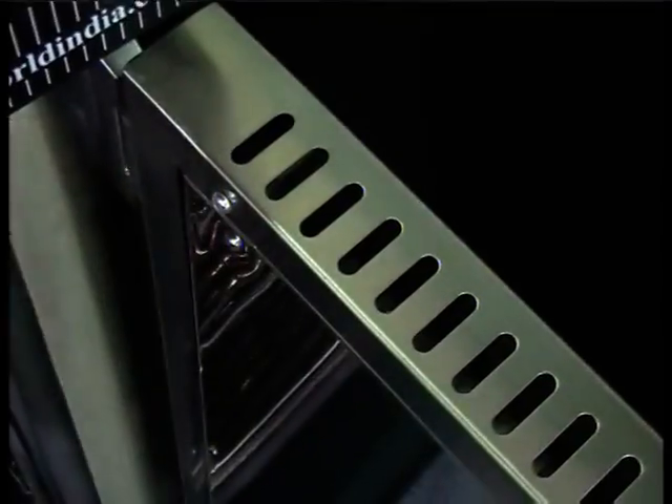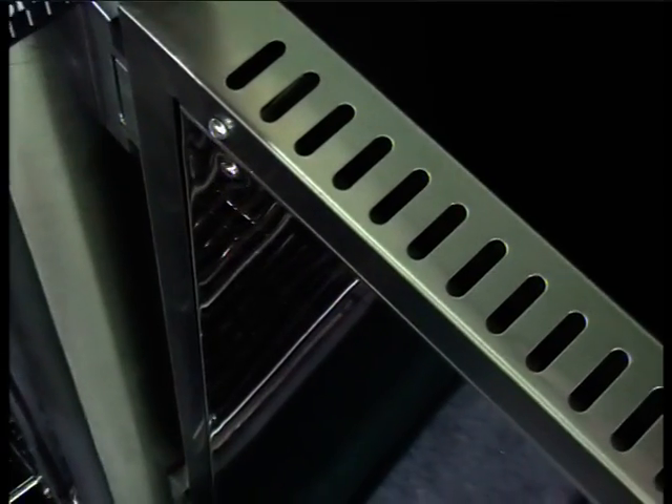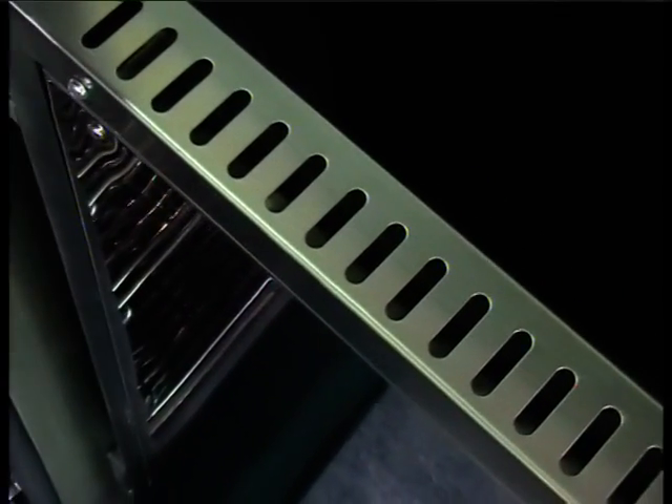Along with the hot air oven, Oswald also manufactures a wide variety of products such as autoclave, stability chamber, walk-in stability chamber, BOD incubator, bacteriological incubator, cooling incubator, vacuum oven, muffle furnace and deep freezer.